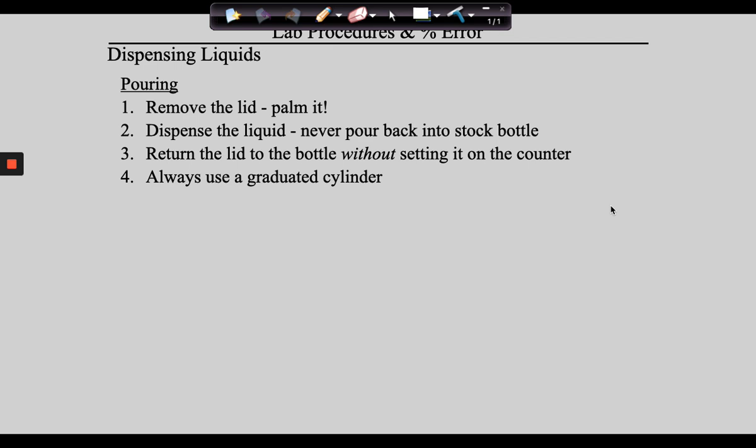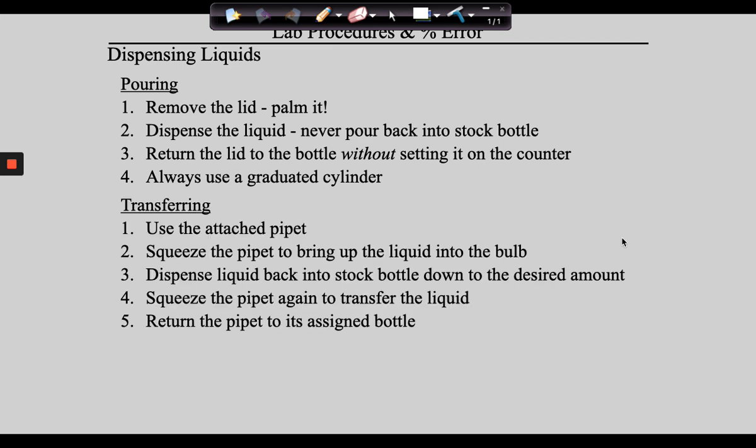So that is what is called the process of transferring. And again, here we can put stuff back in the bottles because that's clean and safe. You guys good on transferring? You good on pouring? All right.